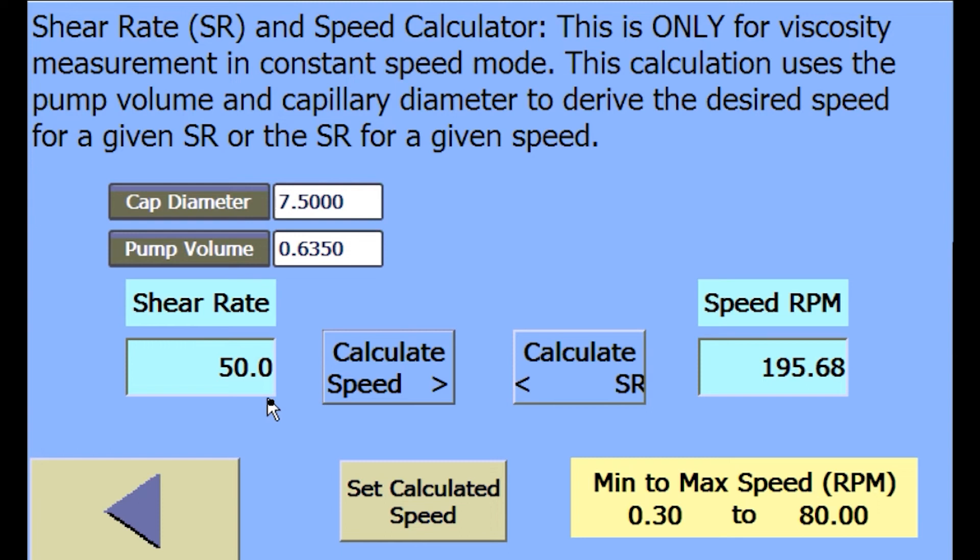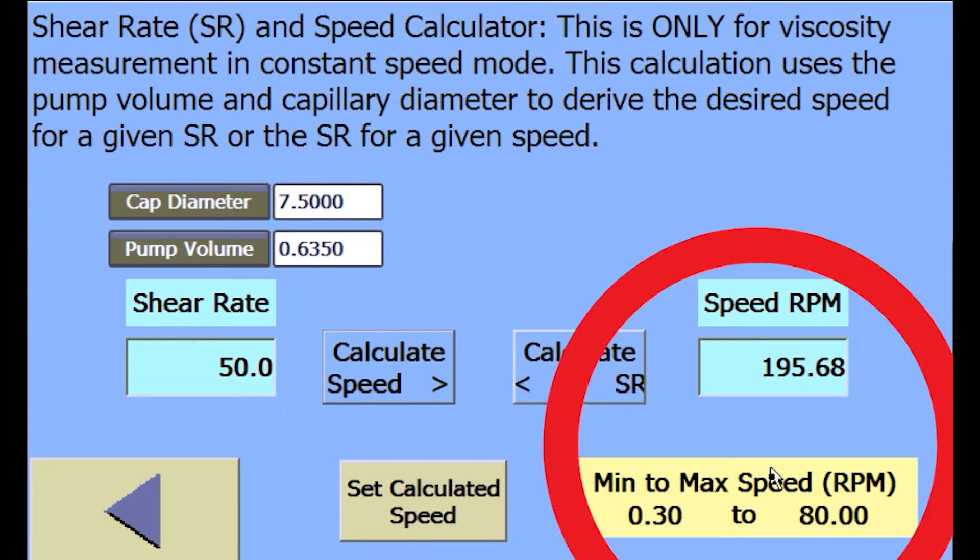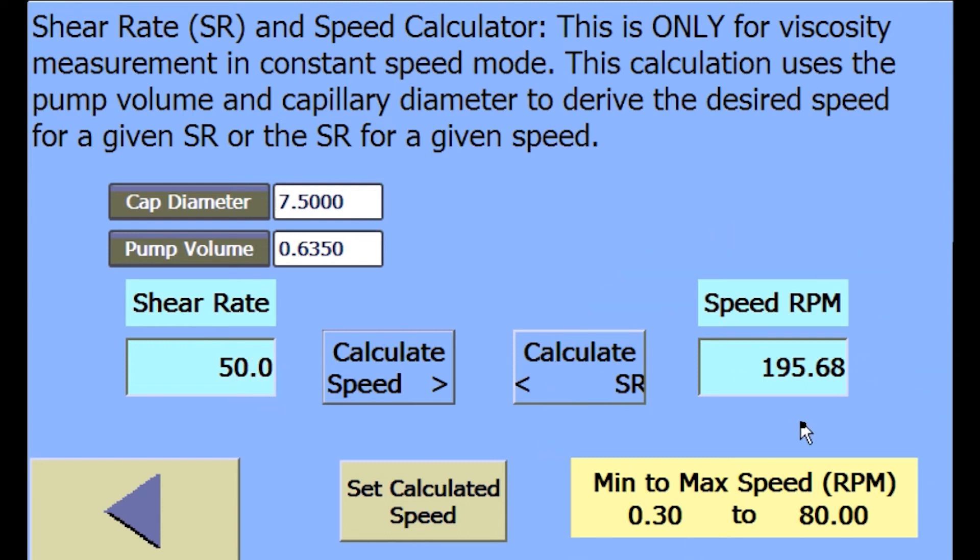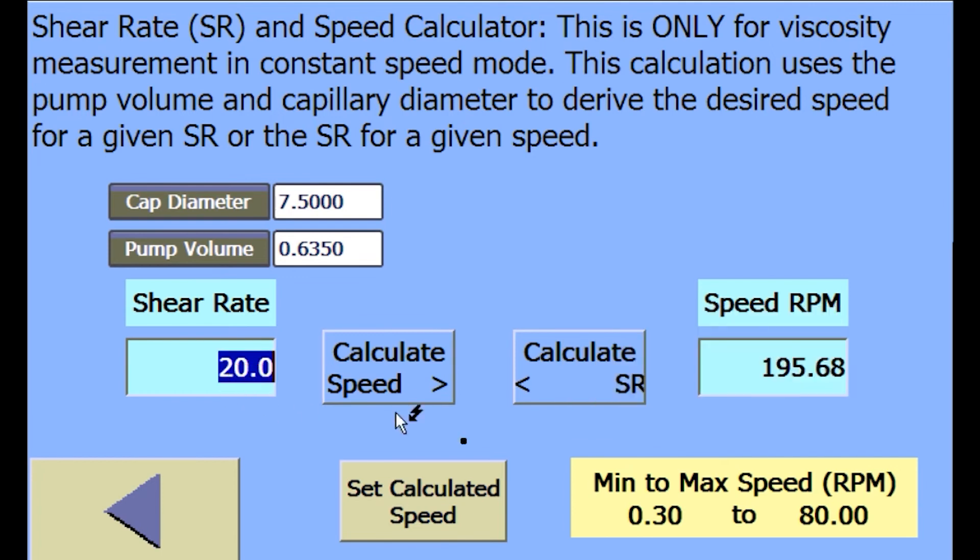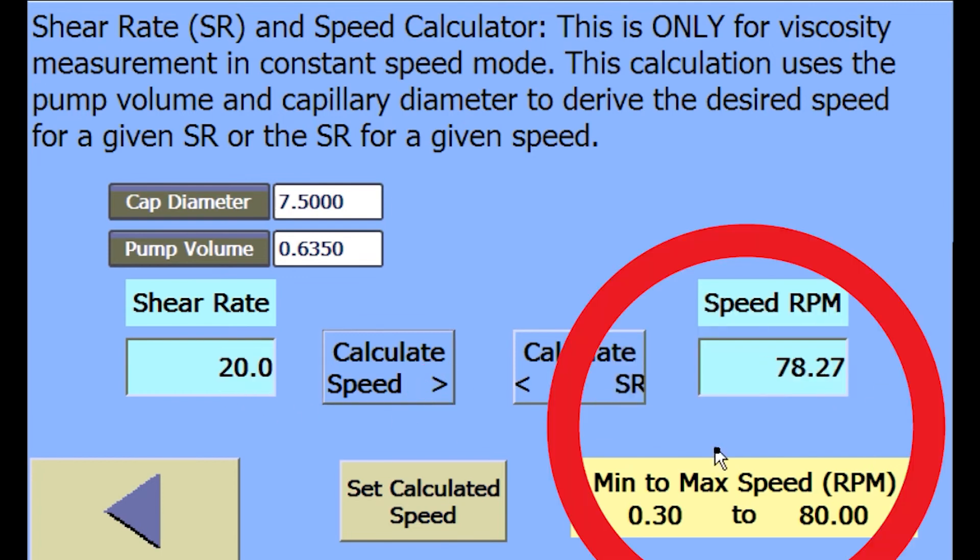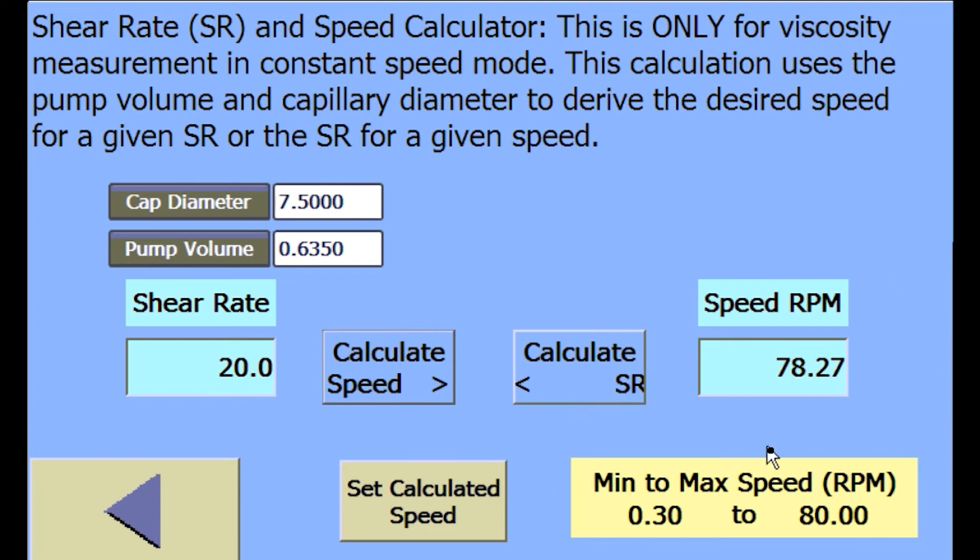With the current system parameters taken into account, the entry of 50 inverse seconds is not possible without a capillary die change. A newer entry of 20 shows that a shear rate of 20 inverse seconds can be run because it's within the range of the pump speed.